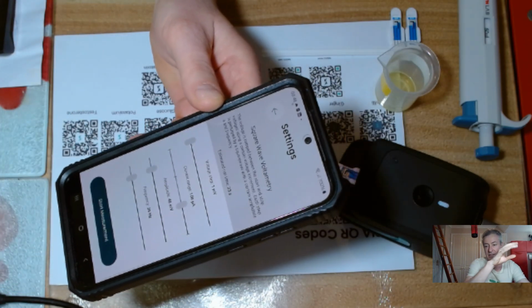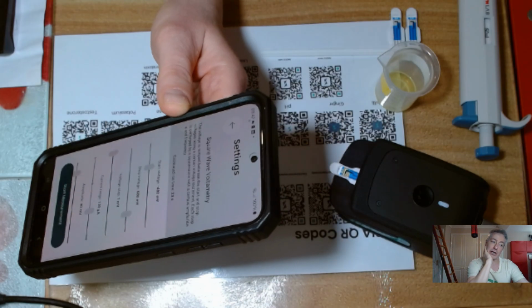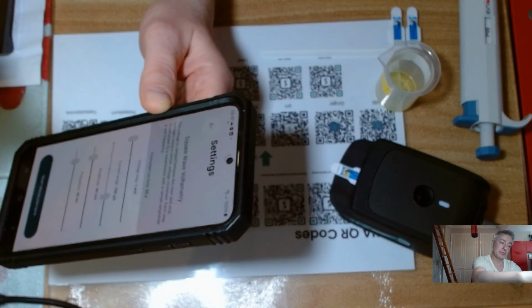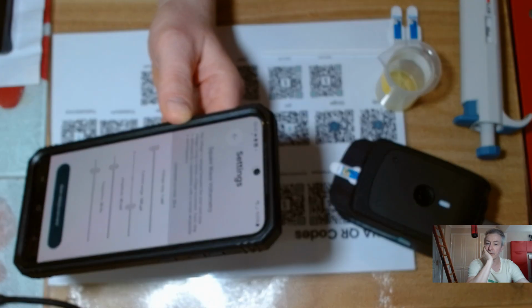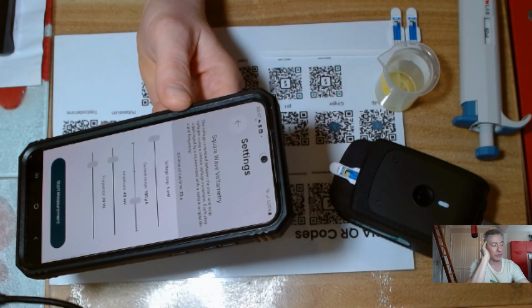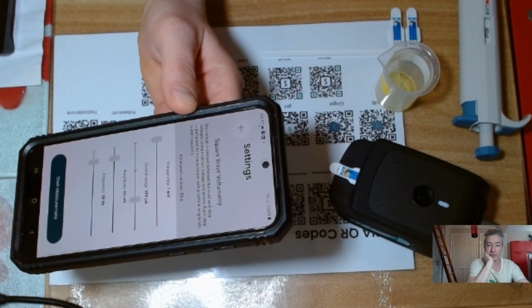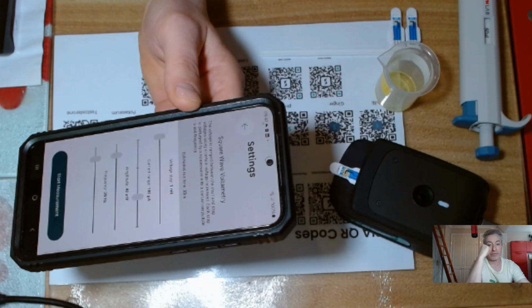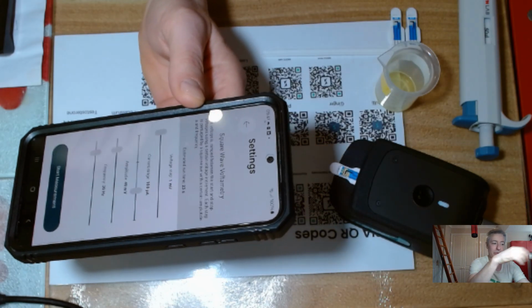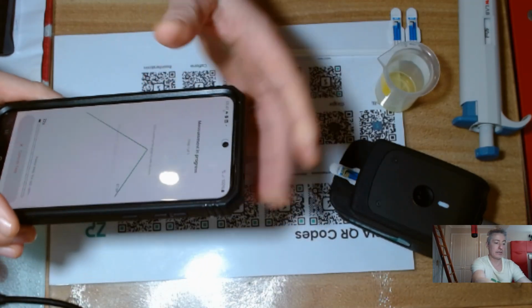What I like about that is there are a few unique parameters in there as regards something like, sorry, not square wave voltammetry, but cyclic voltammetry. The fact is I've got amplitude and frequency. So I feel like square wave voltammetry is kind of a hybrid between linear sweep voltammetry and EIS, electrochemical impedance spectroscopy. In EIS, you do have frequency, which can also vary. Do you always need to do that? Probably not. So I do like square wave voltammetry, and I'll do the experiment really to illustrate why I like it.